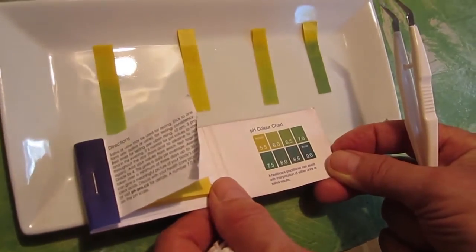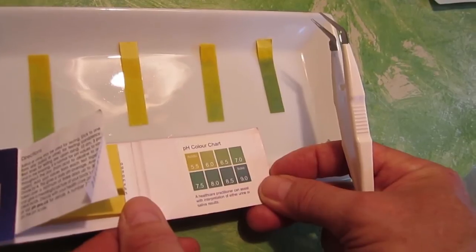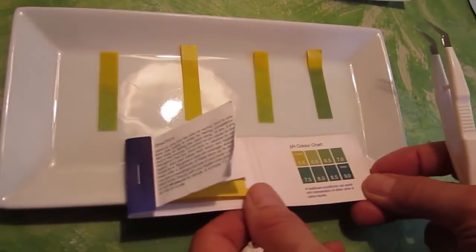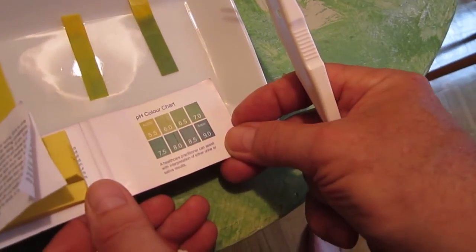The Brita is acidic. The charcoal is almost neutral as well at 6.5. And the spring water, which we collected ourselves, is neutral at 7.